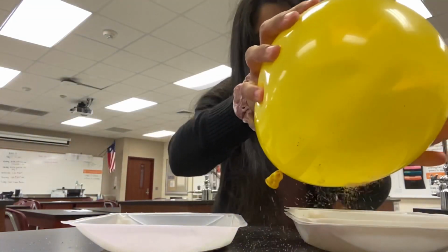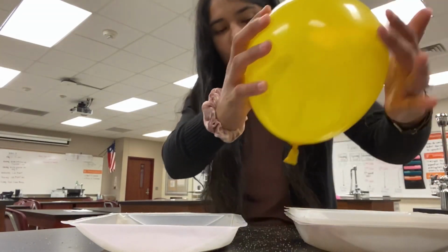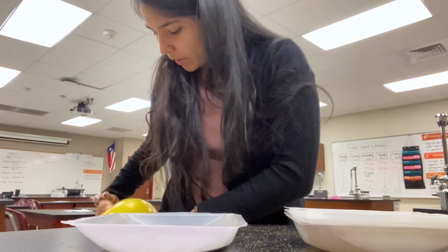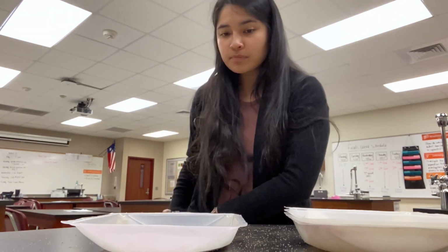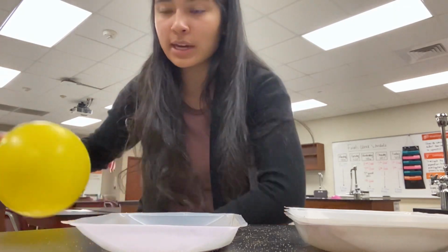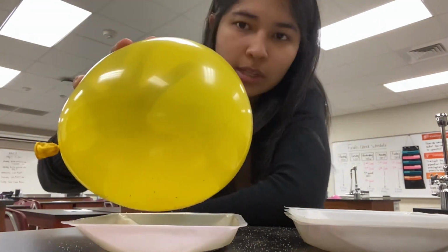But I'm trying to do this quickly so that you guys don't have to watch a 20-minute video again. Okay, so this last time that I performed the electrostatic separation, it didn't pull as much pepper anymore, so I'm assuming that it's almost done. So you see it pretty much stops.